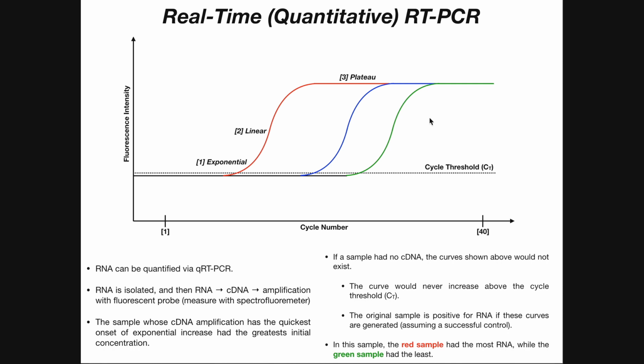Okay? Now here's the problem. If we're looking at DNA or RNA, and I say looking very loosely, they're microscopic. You can't see them. If you try to put it under even a really powerful microscope, you won't see it. Okay? So how do we see RNA or DNA? Well, to do that, we need to attach the DNA or RNA to something that we can see, like something like light, something that's fluorescent.